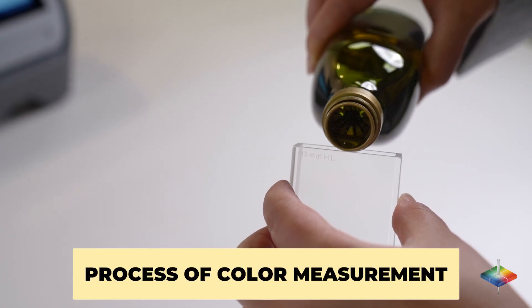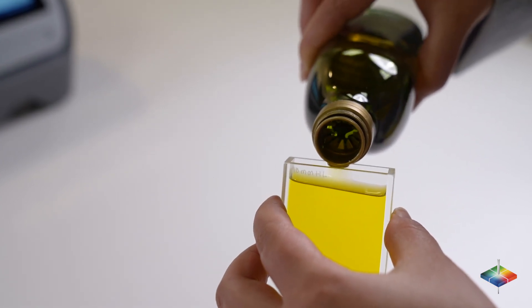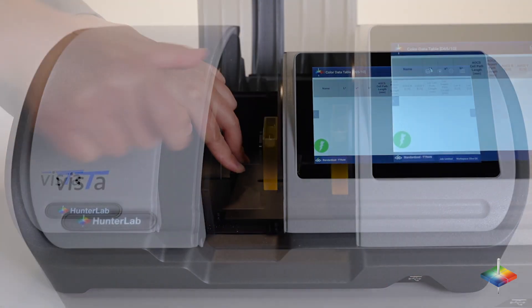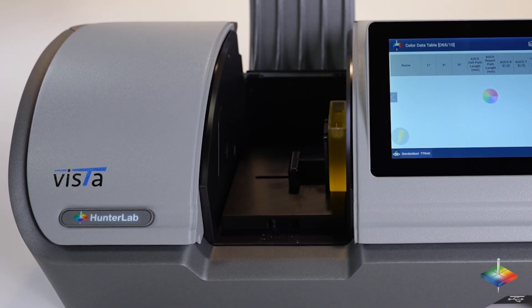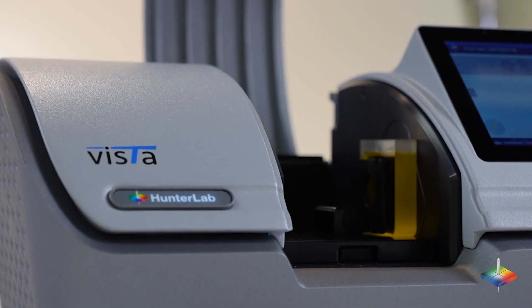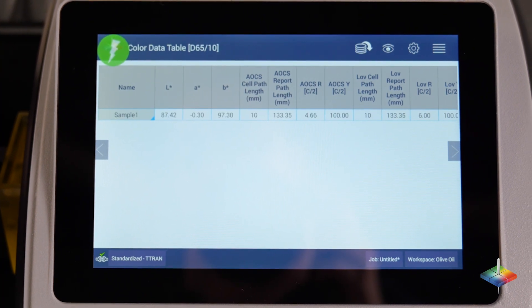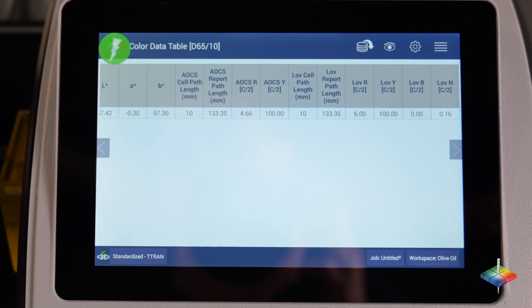Process of color measurement: Pour sample into a glass vial as small as 10 millimeters. Place the vial on the platform inside Vista. Push the go button on the screen. The measurement begins and takes about five seconds. The results are displayed on the screen side by side, including Lovibond RYBN, AOCS and other industry standard scales.